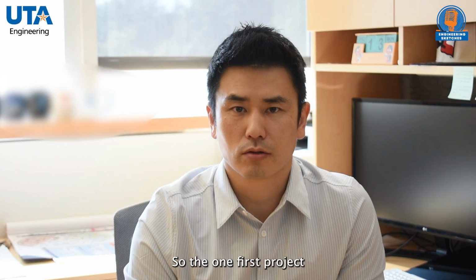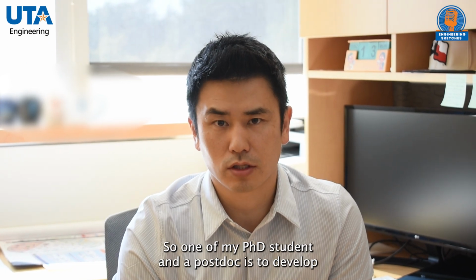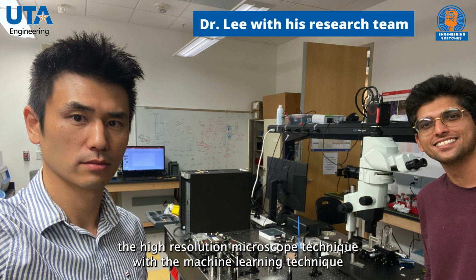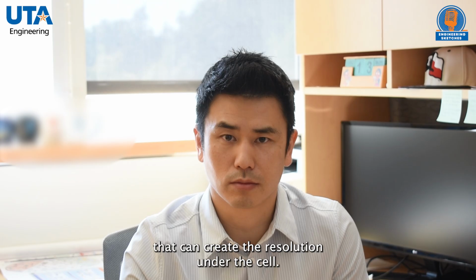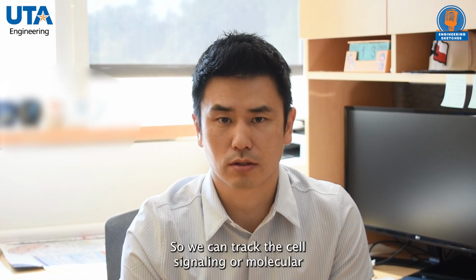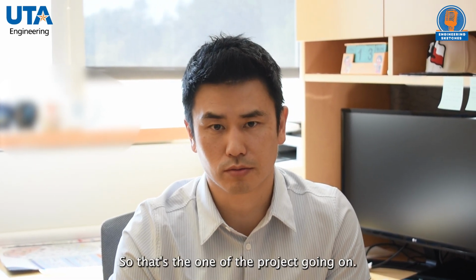So the first project is to develop a high resolution microscope. One of my PhD students and a postdoc are developing the high resolution microscope technique with machine learning that can create resolution under the cell, so we can track cell signaling or molecular signaling in the developing live heart of the zebrafish. So that's one of the projects going on.